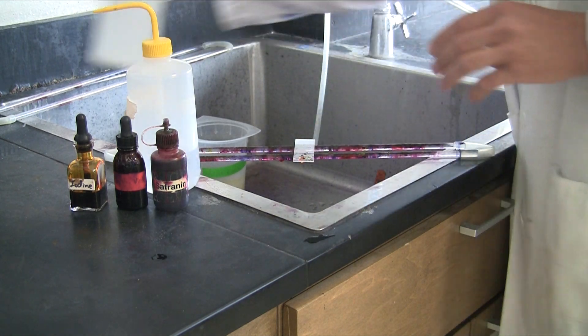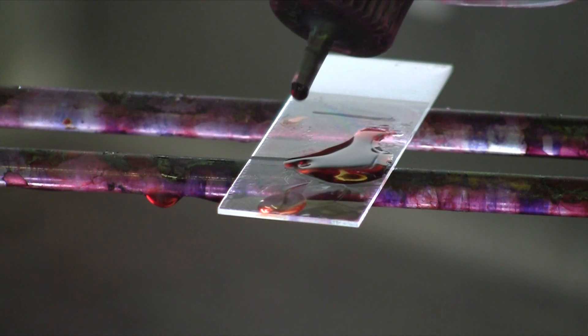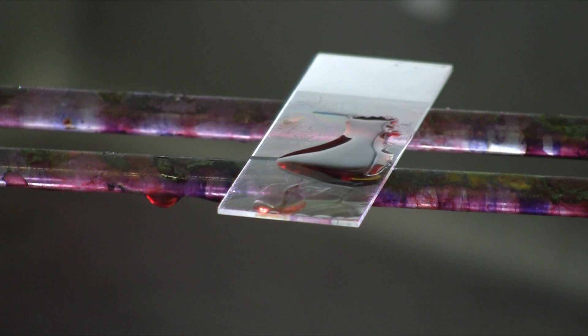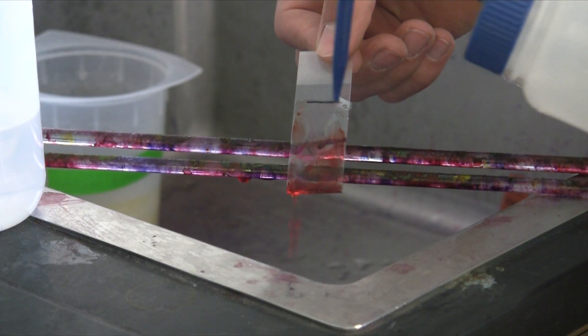At this point, we're ready to counter stain. The counter stain is saffranin. Add that stain on and let it sit for 30 seconds. Those Gram negative cells that lost their stain, their primary stain, will now take on the saffranin.